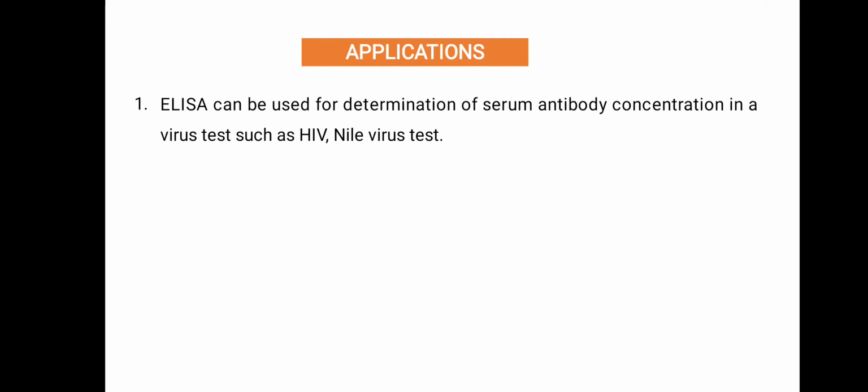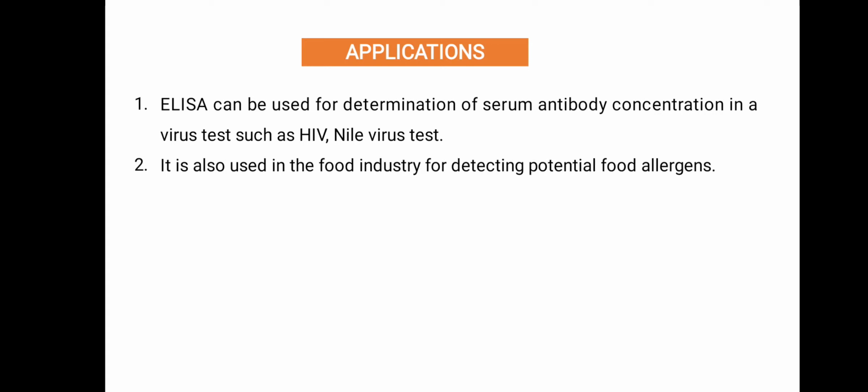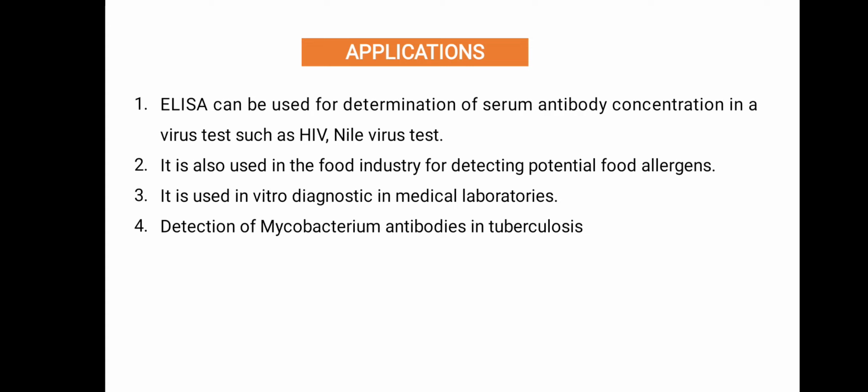Applications: detection of antibody concentration, identification of HIV, West Nile virus test, also detection of potential food allergens in the food industry. It is used for in vitro diagnostics in medical laboratories. Detection of mycobacterium antibodies in tuberculosis, detection of bird flu, etc.